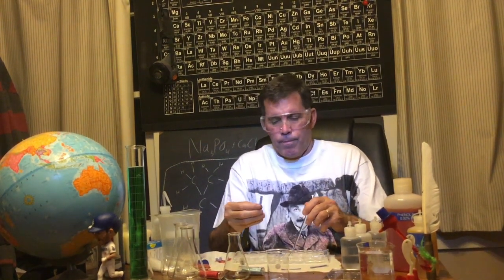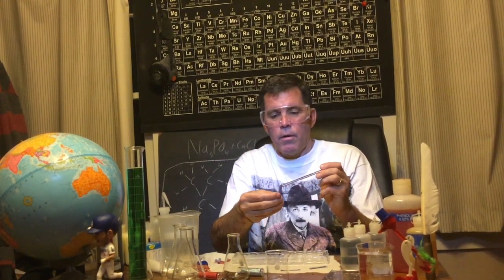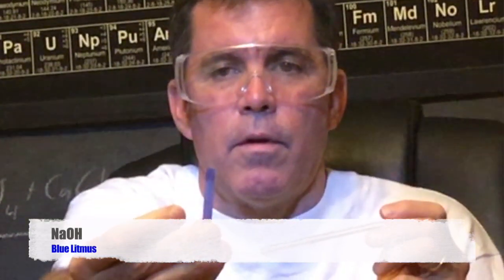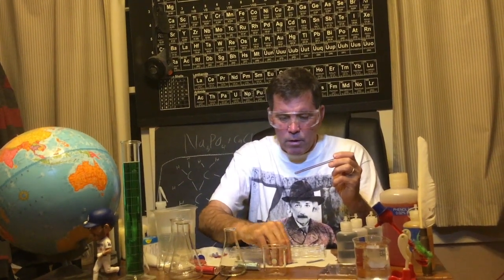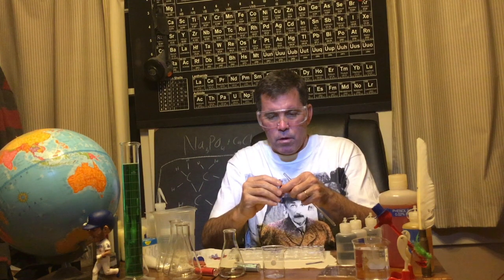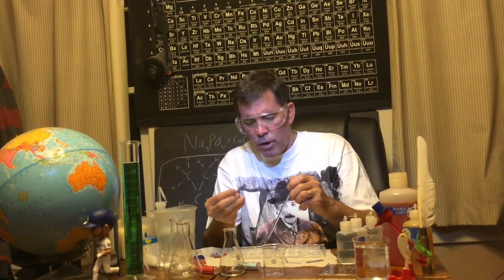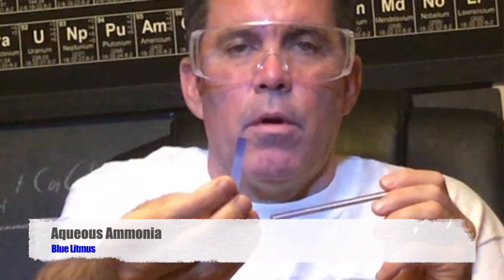What do you think is going to happen? So take a guess. Let's see if you're right. And lastly, we're going to take the aqueous ammonia with blue litmus. You can see what happened.